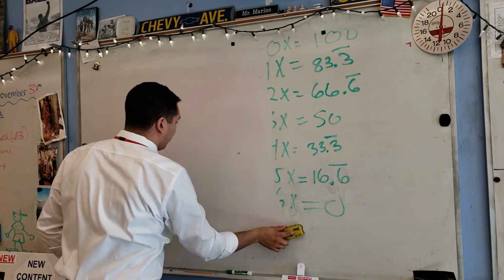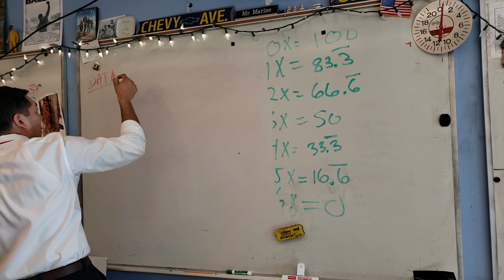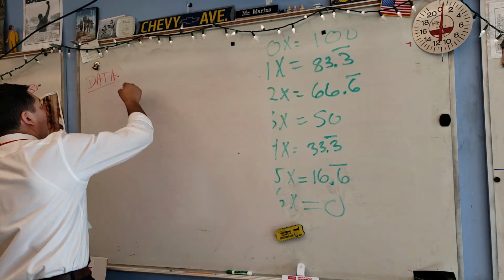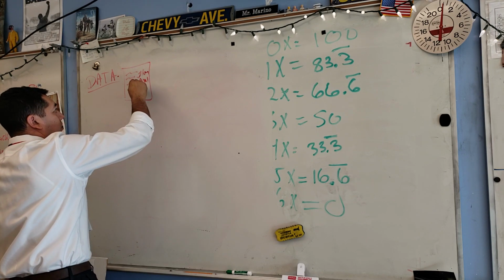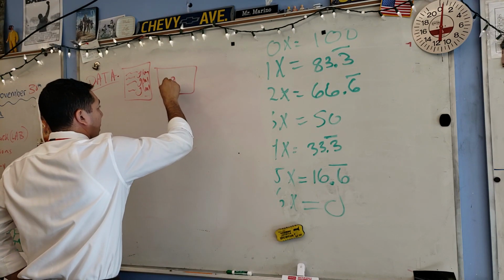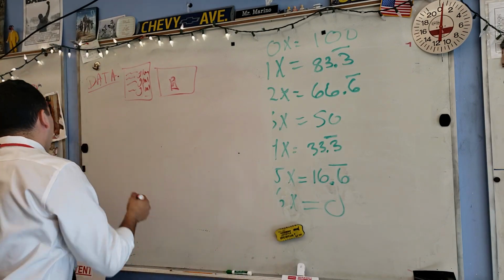This photo is going to be posted in the data. Okay? That's going to be the data, and your data is going to have all the information of all the liquids and their densities, in g/ml, and it's going to have the picture. All right, all that goes into data. The next part, analysis.